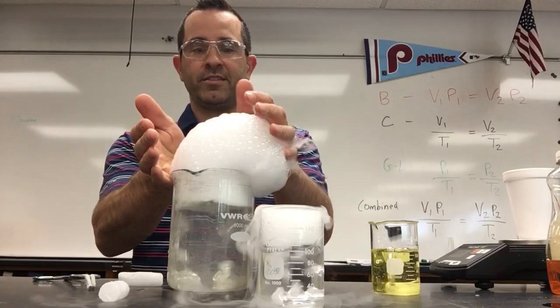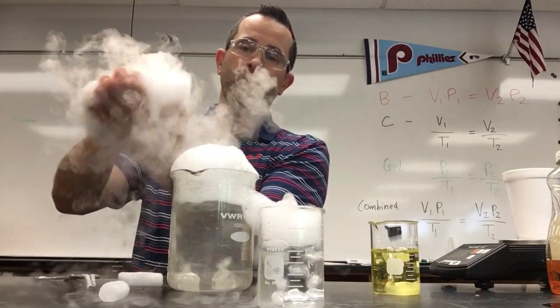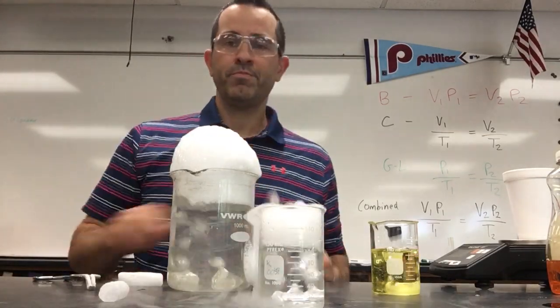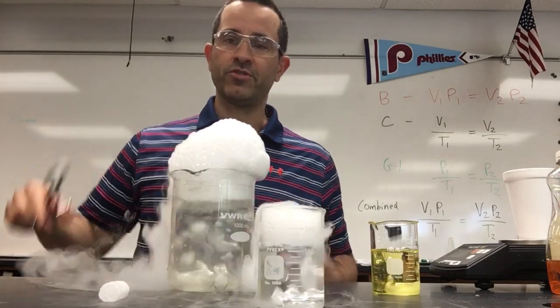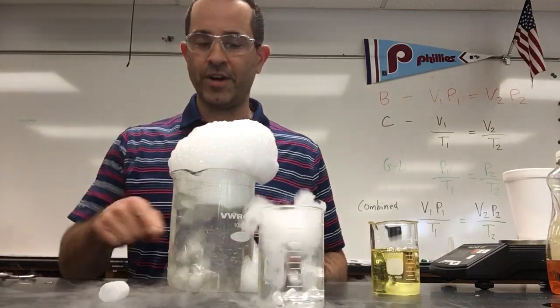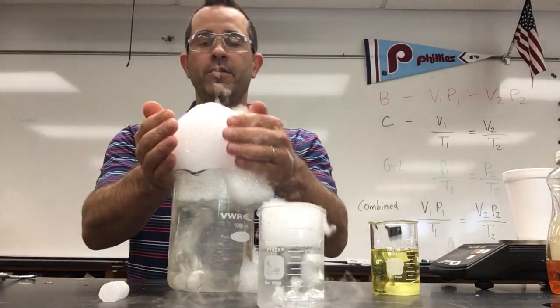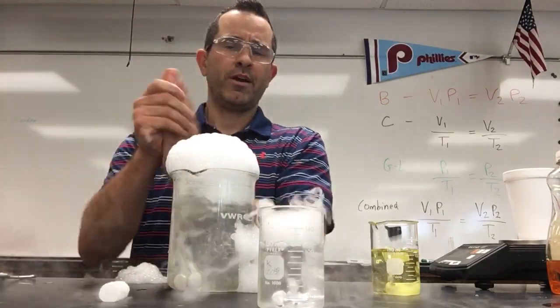I'm going to take these soapy bubbles and smush them. And then I've got soap, I can wash my hands and clean hands. Personal hygiene is fun when you're talking chemistry. I'll drop another piece in here to speed up the process. If I use hot water, it would happen even faster, right? All right, hands are nice and clean.